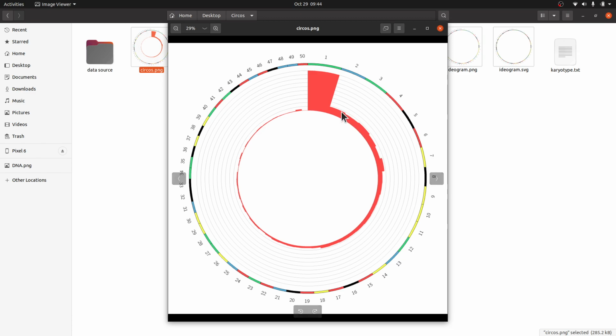All right, so those ones you have to decide how best to represent and interpret your data. Now, this same plot can be used to also represent other information. Okay, so it depends on you, by the way. So Circos allows you to generate different plots, and so at the end of the day, you have to properly plan and make sure you know what you are doing. All right, so that's it. So that will be all for this tutorial.